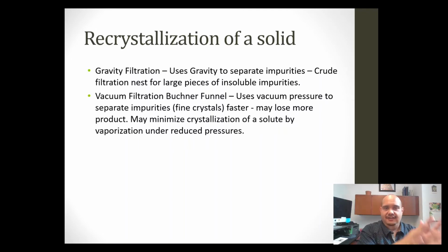You take that, you let it cool at room temperature, and it starts to grow a crystal. After it's cool to the touch, you put that on ice, and then you get the rest of the crystal yield out. That is what gravity filtration is for.